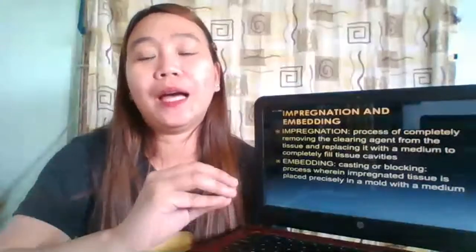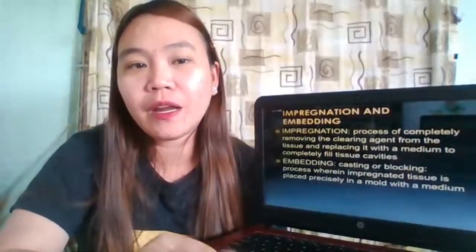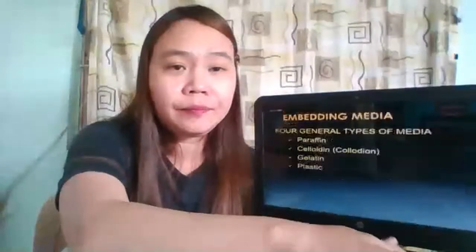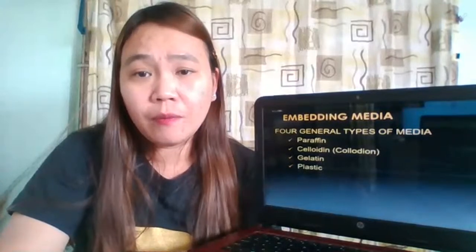So I hope the definitions and purposes of impregnation and embedding are clear to you. Let us move on to the different types of embedding media that we can use in order for us to perform infiltration and impregnation. Please do not be confused when I make use of the terms embedding media and infiltration media, because just like what I mentioned at the start of our discussion, in most cases we make use of the same reagent.